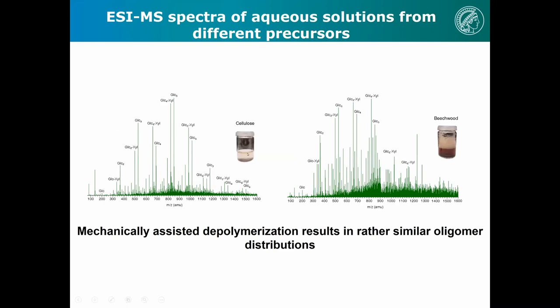This is what it looks like. Here is really what is left over of a paper handkerchief. It's clear, completely clear, a water-like solution. You add water to the milling product. If you have wood, it's also clear. I'm not sure whether you can see it, it's transparent. It's just brown. This is the aromatic ring of the lignin compound, which gives the brown color.